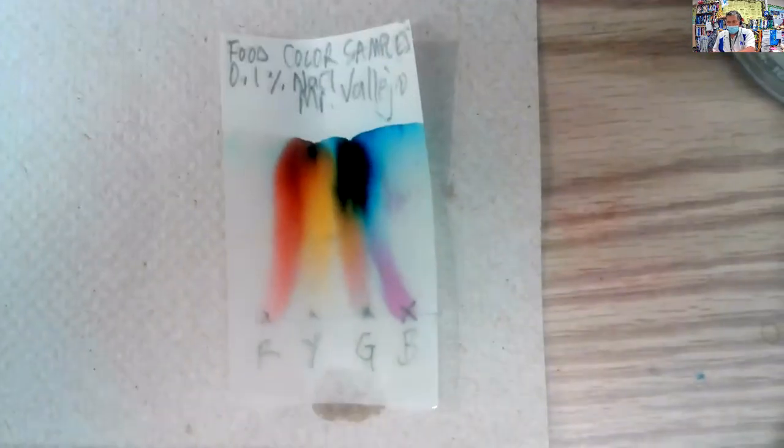Now, one thing I do when we do this experiment with photosynthesis is we do something similar, but we actually measure the distance traveled. We can calculate a value called the retardation factor, or RF. We will not be calculating RF today, but what we wanted to do was look at the different colors that make up each of the four different food colorings. And so some of them are made up of even three different colors. Hopefully you can see that. Some are made up of two and some are made up of one.